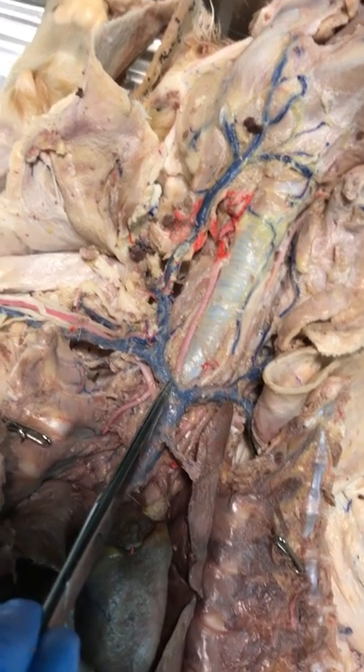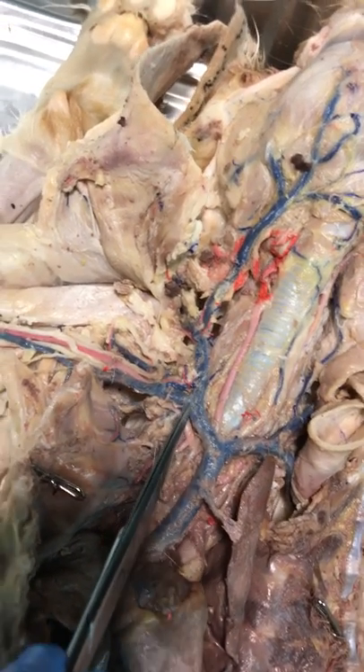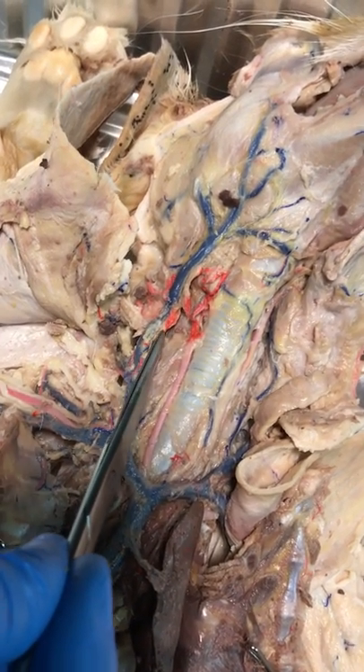Going back to the center and up this time: we've got the right brachiocephalic trunk. Here is the subclavian, but let's go up to the jugular. The jugular traces itself all the way up — we're just doing the external jugular.